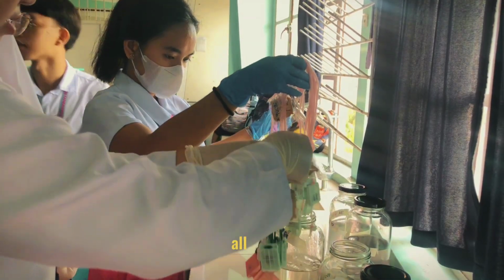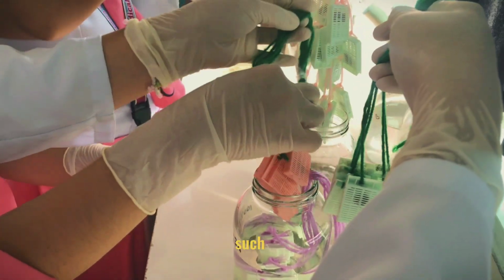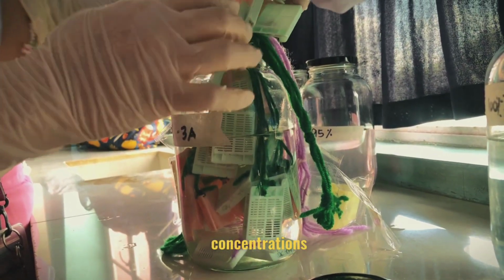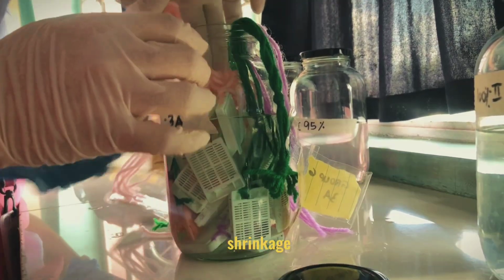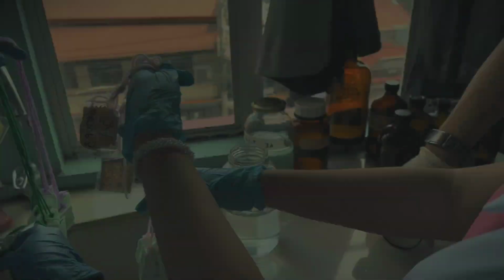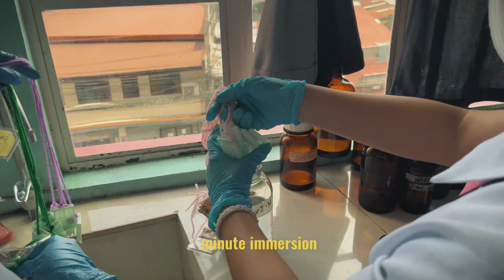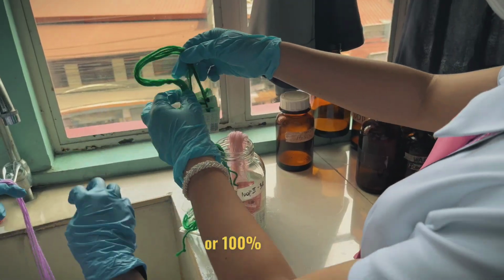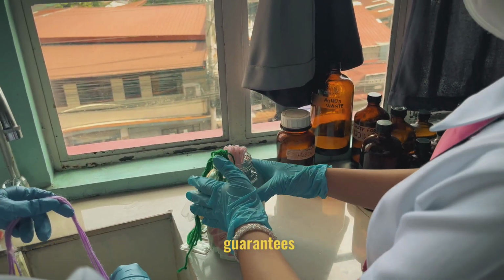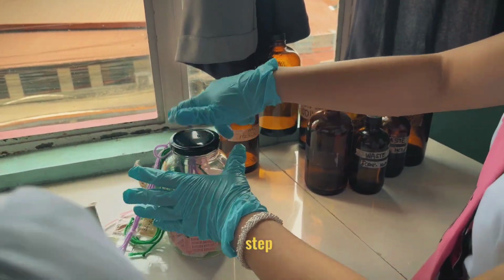This process removes all water, which is essential for subsequent procedures such as embedding in paraffin. Gradually increasing the alcohol concentrations helps prevent shrinkage and preserves the tissue structure and morphology. After that, we will perform another 30-minute immersion in absolute or 100% ethanol. This second round guarantees complete dehydration, which is key for the clearing step.